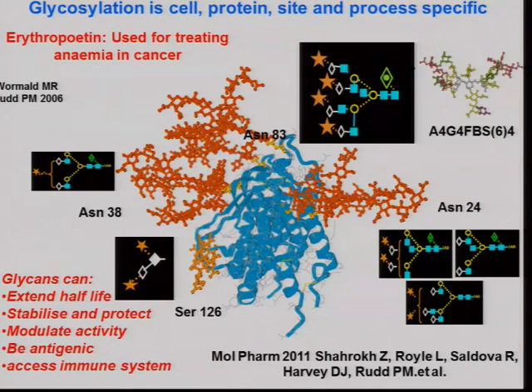And another question is about the purification steps that you do before analyzing this protein. Do you use only protein A, or do you use the whole purification train that is usually used? We can do that if we are looking at an end product. But usually we just use protein A, because we know that we can wash out host cell proteins, and we can check there's nothing significant there except for IgG. Or we could use hydroxyapatite, like Pete Gagnon, for example. There are different technologies for pulling out IgG. But we were trying to design something that you could use quickly at line.